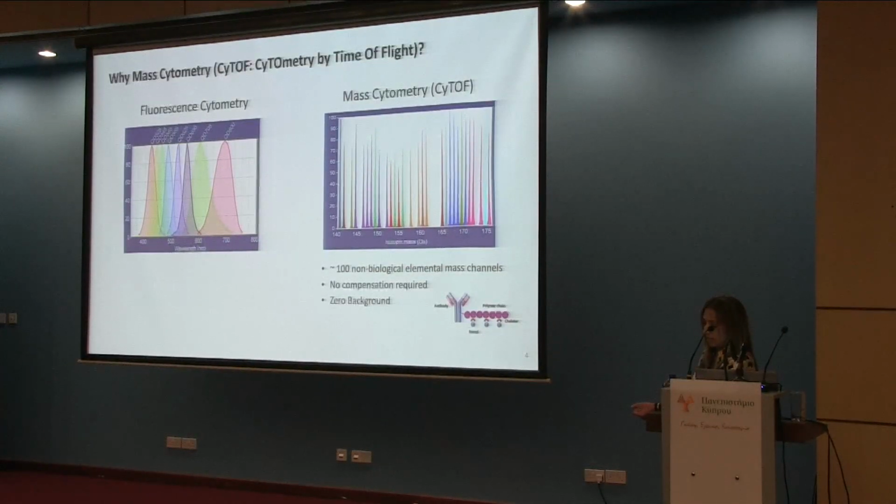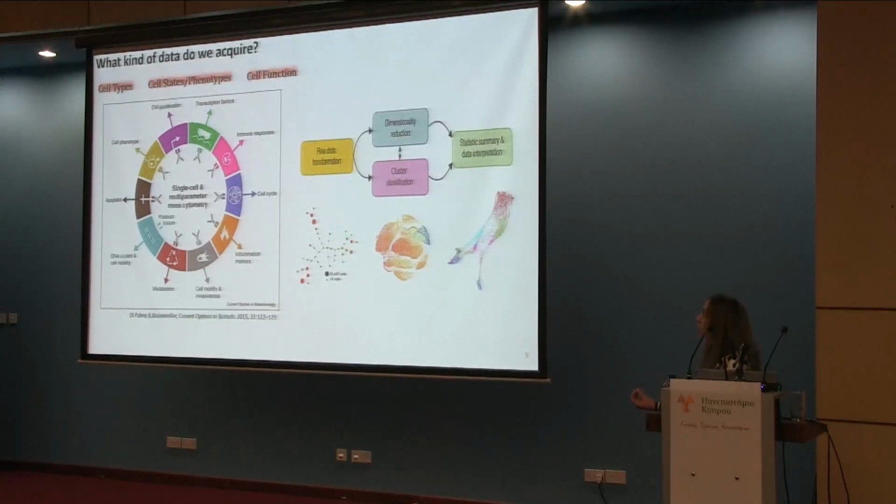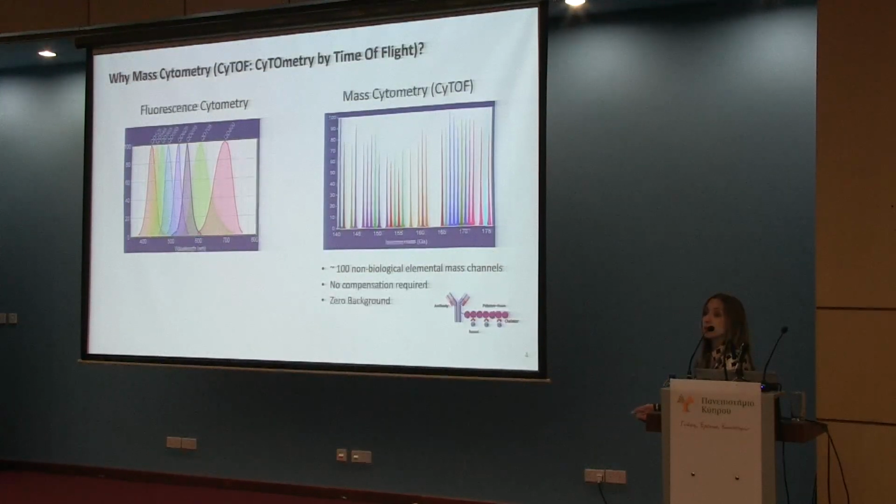So what is mass cytometry, otherwise known as CyTOF? If you know about flow cytometry, you're halfway there. Instead of using fluorophore-conjugated antibodies as in flow cytometry, you use metal-conjugated antibodies. Flow cytometry has become better, allowing up to 10 to 12 antibodies at a time, but because with metal antibodies you avoid the spectral overlap of fluorophore antibodies, you now have the ability to interrogate up to 50 antibodies per cell in your clinical specimen. And theoretically, you can go up to 100 markers per cell.